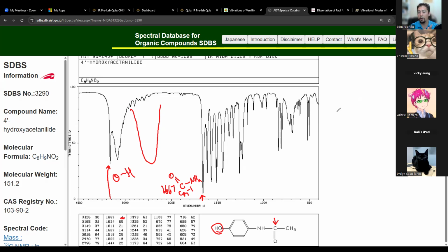Look up maybe acetone, water, look up acetaminophen, ibuprofen, aspirin. You just can't look up drugs. I tried. You can't find methamphetamine. You can't find all these things. This database does not contain those spectra. Okay. But just play around with it. Check it out. Very useful. Play with CHEM223A. Come to office hours.